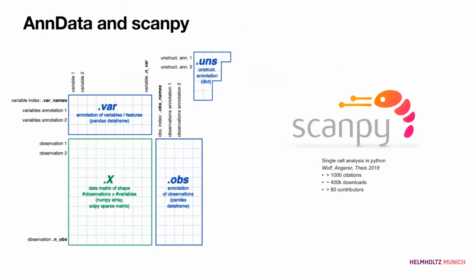Right. Okay. So the main data structure that we're using here is called AnnData. This stands for annotated data frame. And yeah, essentially it's exactly this.